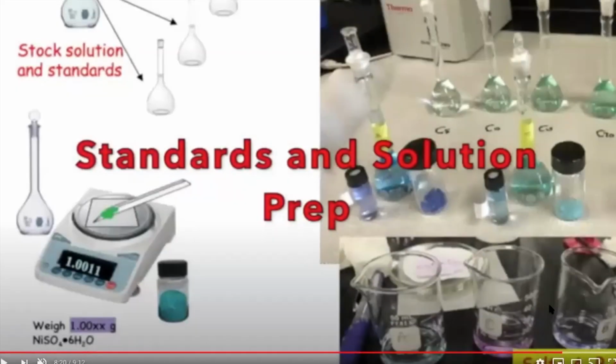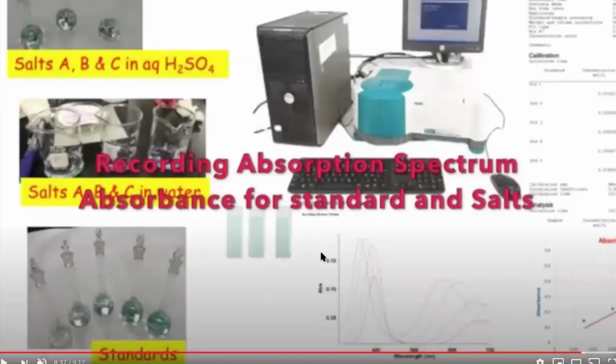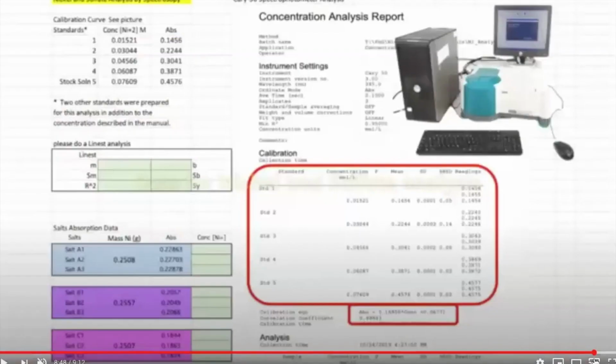For the nickel analysis, this is what it looks like. I'm showing you the PowerPoint in which that happens. And then I'm actually recording the absorbance for, see how they're all green for your unknown? That's because it's the nickel that's being analyzed.